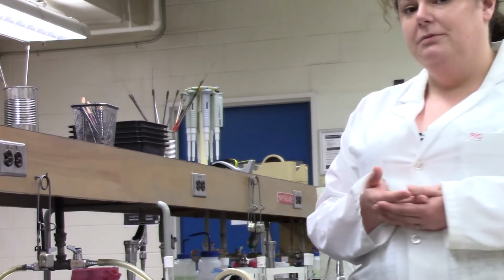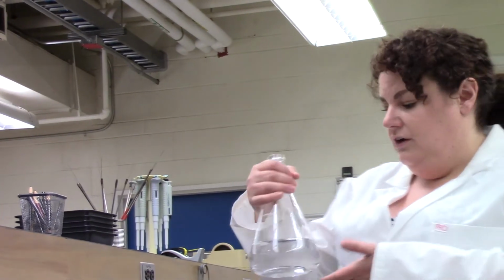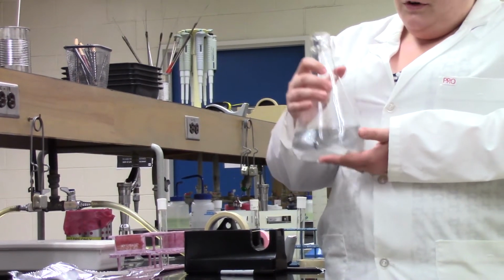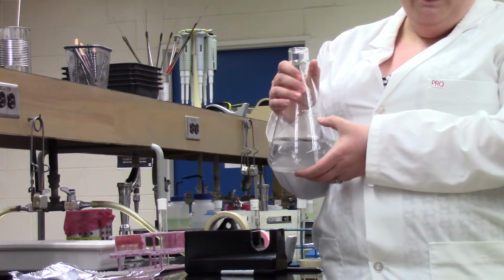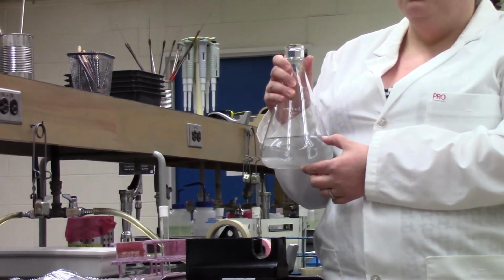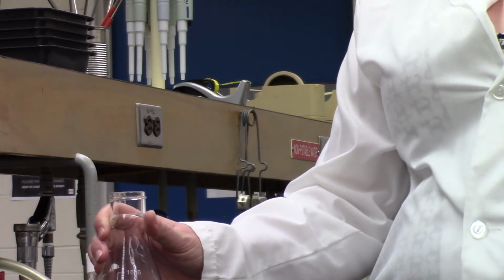Now in terms of getting something ready to go into the autoclave, there's a few important points to look at. So let's say that I've got a flask full of media and I'm wanting to sterilize this. First off, I want to point out how much media is here in my flask. So I am holding a 1,000 milliliter flask and I've got it filled up to the 500 ml mark. This is the most that you want to fill it. You only want to put half of the maximum capacity into the flask.